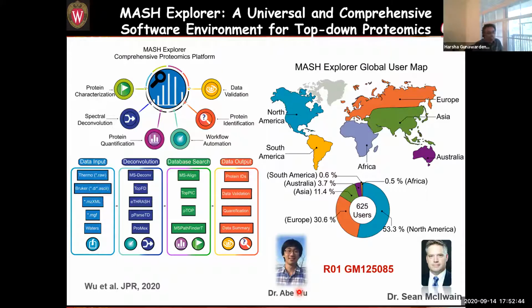So in your experience, using different algorithms to deconvolute the data, you might definitely get differences in certain types of proteoforms, or even certain types of lower level, especially the low level glycoform. Right. So what is your experience in using these different algorithms? Is there some way of unifying the answers together, or do you go with one over the other? How do you determine that?